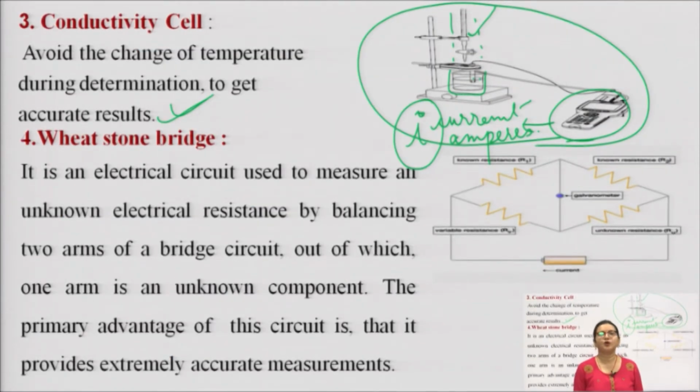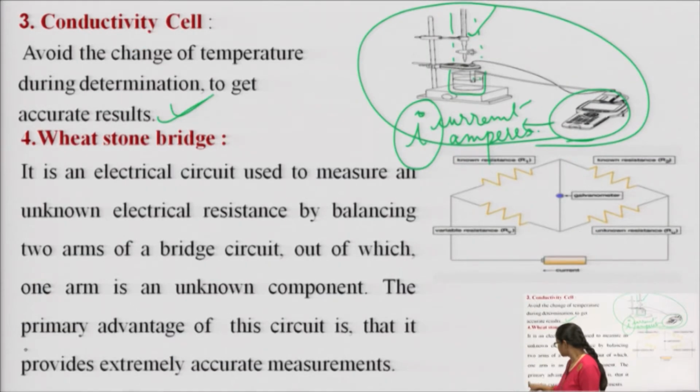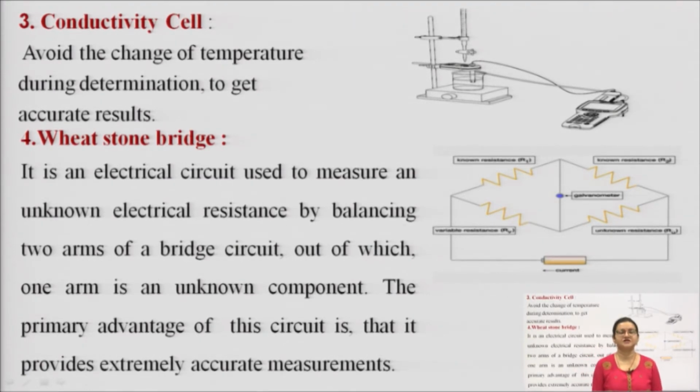Then comes the important part of this slide, that is on this conductivity measurements, the Wheatstone bridge. Wheatstone bridge, what is a Wheatstone bridge?